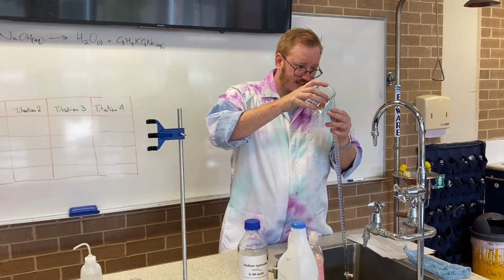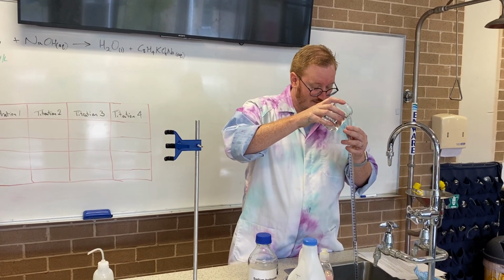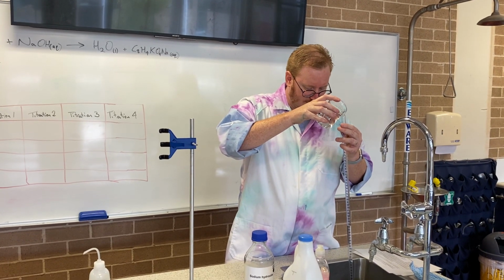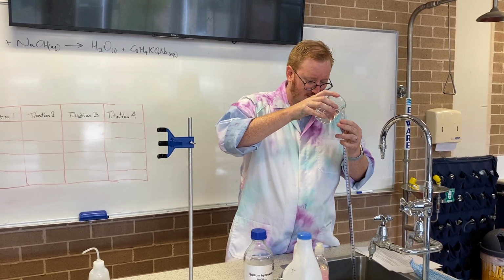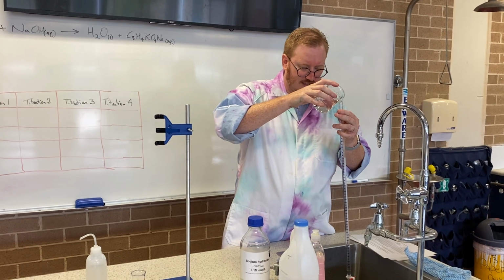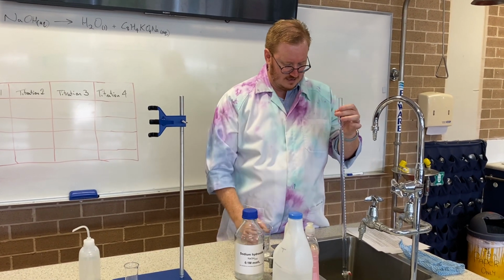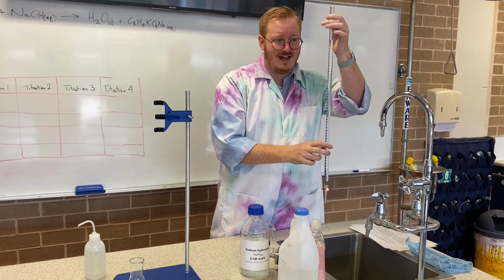And remember what I say, if I see that on your sheet one time, I'll just presume it's a coincidence. But if I see it on your sheet more than once, I'm going to assume that you've been wasting your own time and probably mark you down for that. You just need to get it somewhere near the top. It doesn't matter where. If you ever go over the 0 though, let some out of the tap.